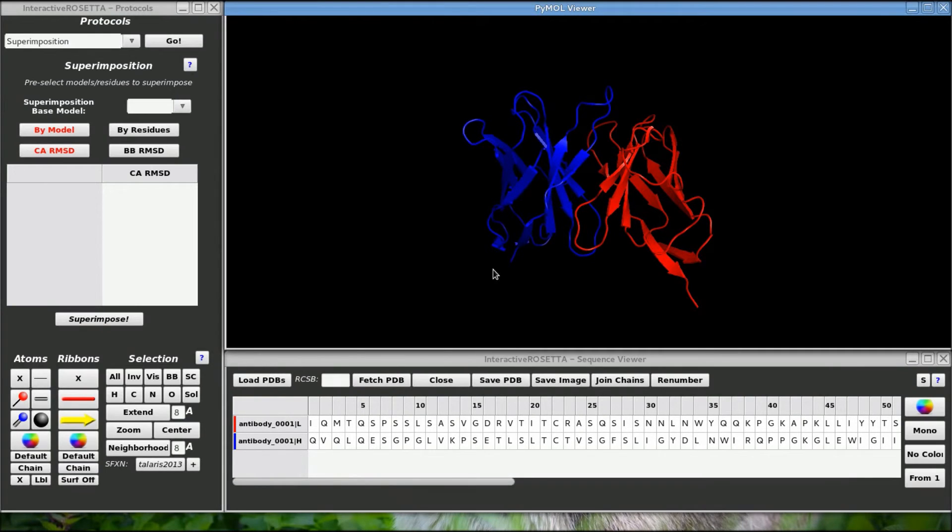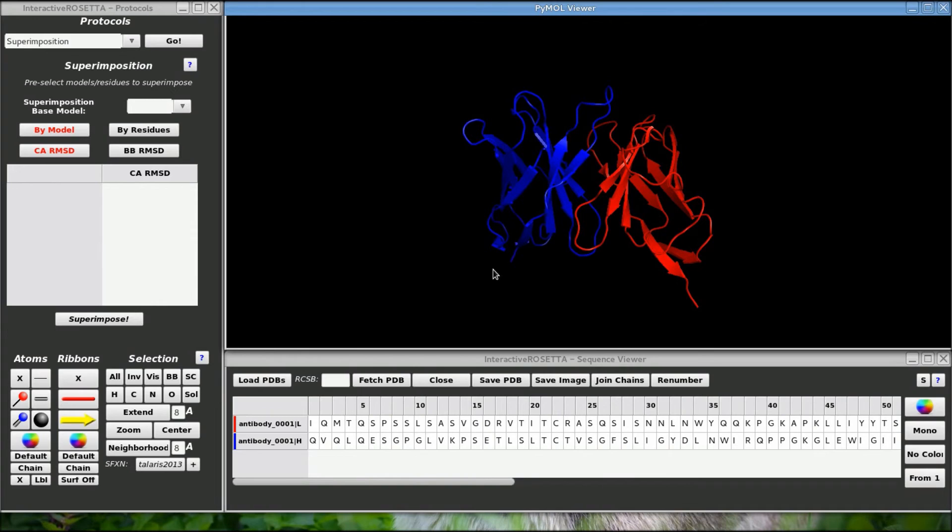If I need to unpack the archive to get the 10 structures back at a later date, I can use the unpack feature of the ensemble generation protocol to get the structures back. I can also take that ensemble archive and use it in an ensemble docking protocol.